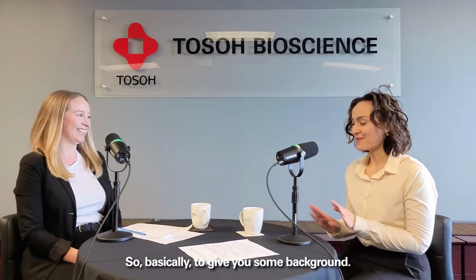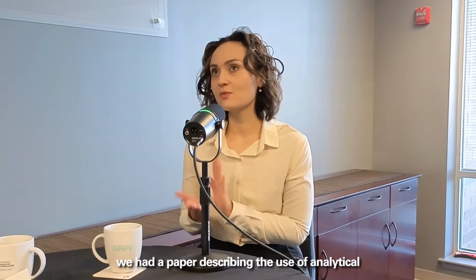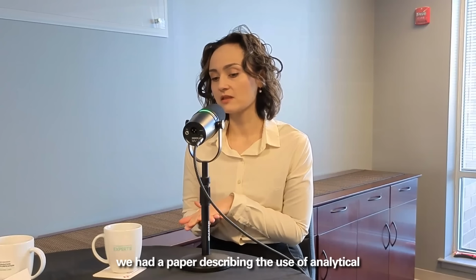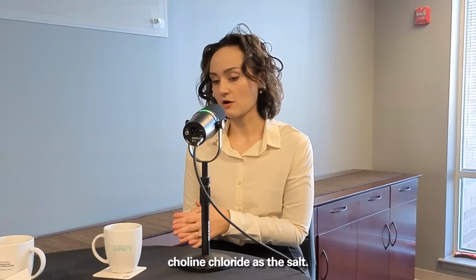virus capsids. To give you some background, previously we had a paper describing the use of analytical anion exchange chromatography using choline chloride as the salt.